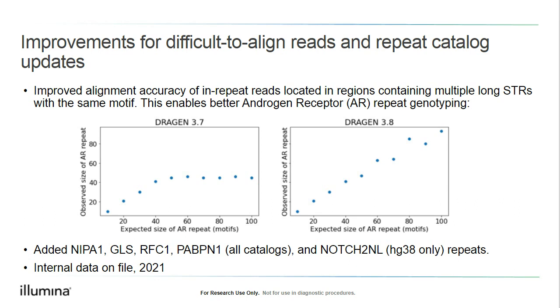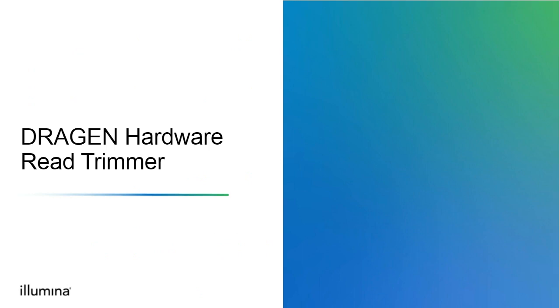So if you are interested in the repeats related to these genes, they have been added to the catalog, and also some which are specific to hg38.